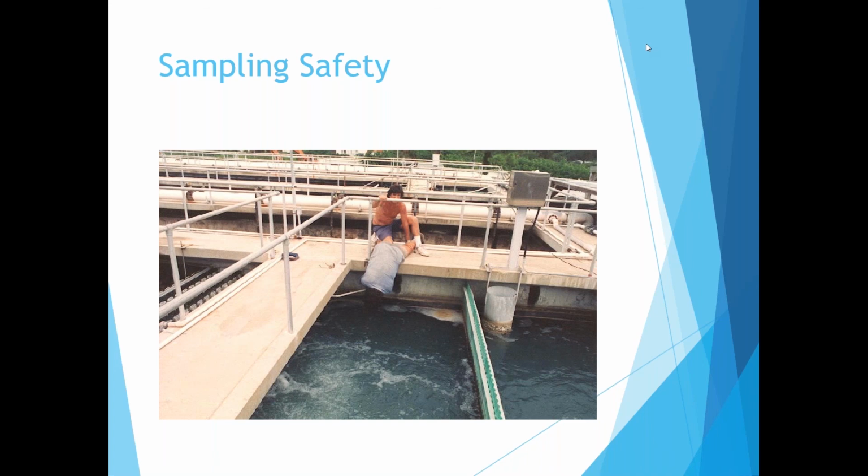Cornell, do you see that there may be variations from state to state telling the permittee when the sample time is to be recorded for a composite sampler? It may be that some states might require the sample date to be the date for which the greatest volume of the sample was taken, but it seems that most states or EPA require it to be the time of the last sample aliquot collection. That's more common, the time of the last sample aliquot.